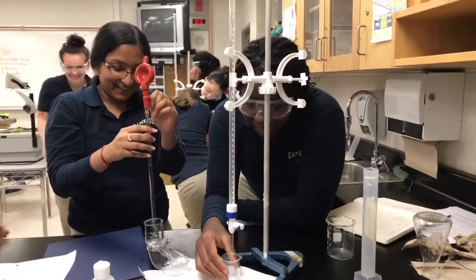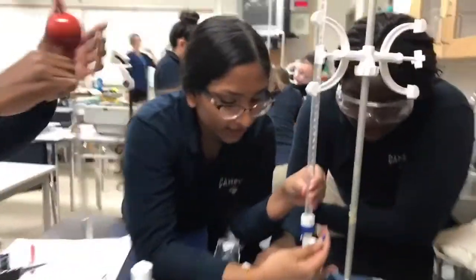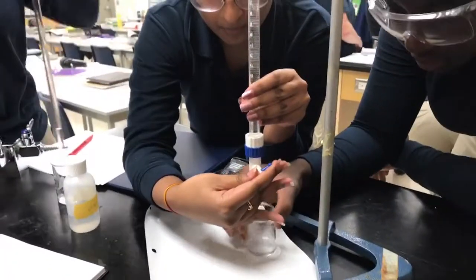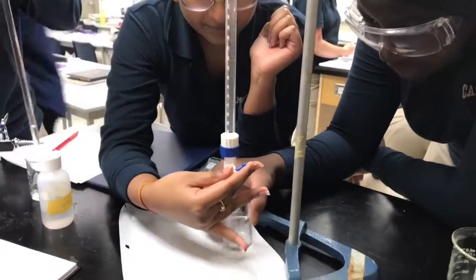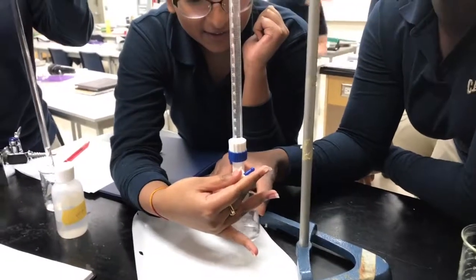Can someone turn it for me? Ready. So right now Manisha is opening up the burette to let go of the NaOH so we can put it into the vinegar to neutralize it. And this is what we call titration. Our goal is to get that very light pink that you saw before, and this is our trial number two.